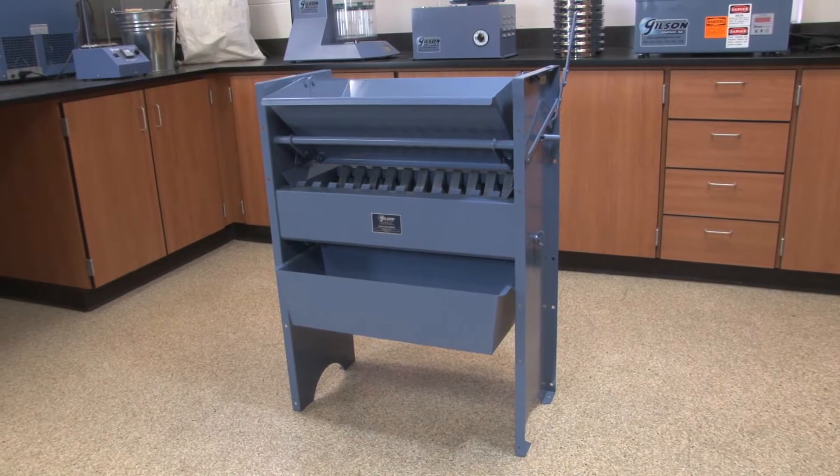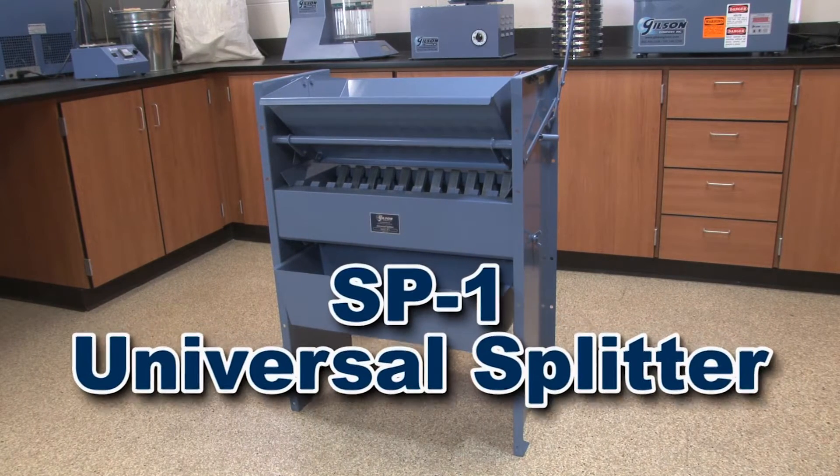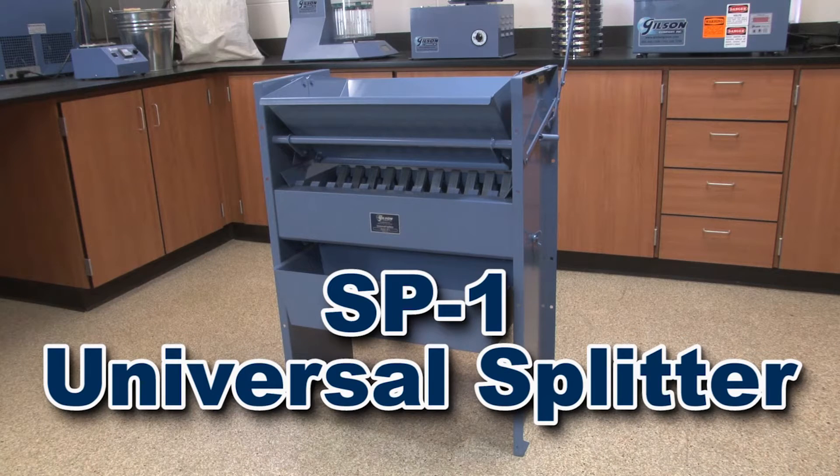Let's take a look at some of the exclusive features of the most popular and versatile model in the Gilson Universal Splitter series, the rugged and large capacity SP-1 sample splitter.